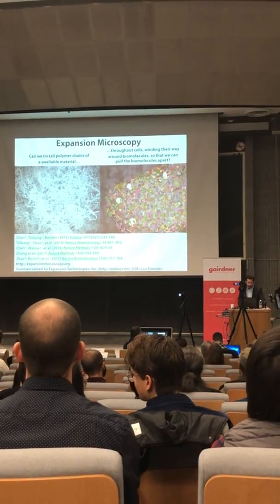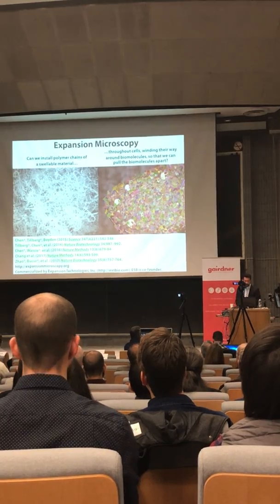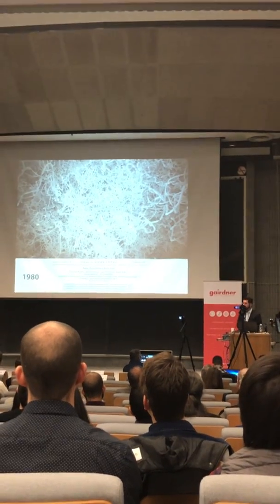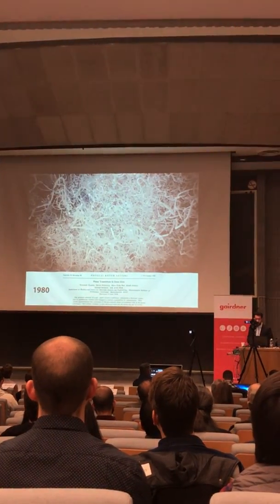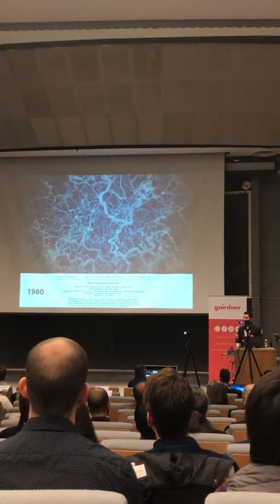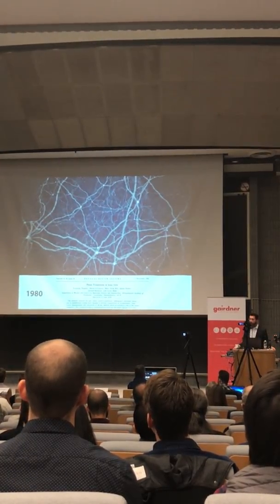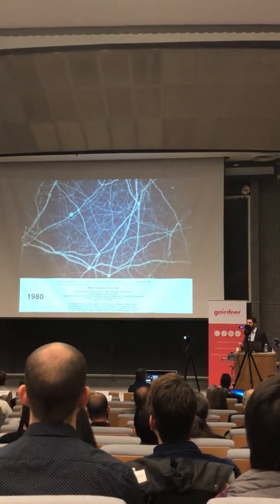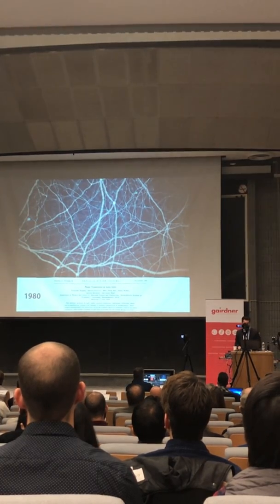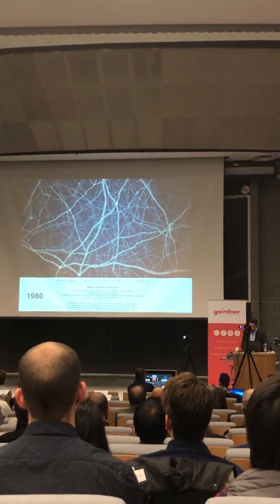So starting with two grad students, Faye Chen and Paul Tillberg, in my group, we decided, could you actually take the brain and do the opposite, expand it and blow it up? And so this combines two old lines of thinking. Toyoichi Tanaka was a physicist who worked out a lot of the physics of so-called ionic gels. These are polyelectrolytes, such as sodium polyacrylate, maybe better known as the active ingredient in baby diapers. And when you add water, osmosis draws the water in, and you get this enormous swelling. And since the polymer backbones are highly charged, you get this even bigger expansion. And so he showed that the physics of this could nicely explain these 1,000-fold volumetric changes in the polymers used in the pure state.